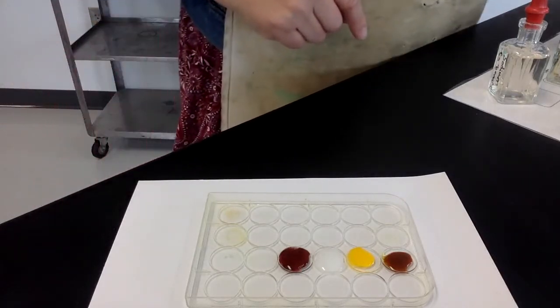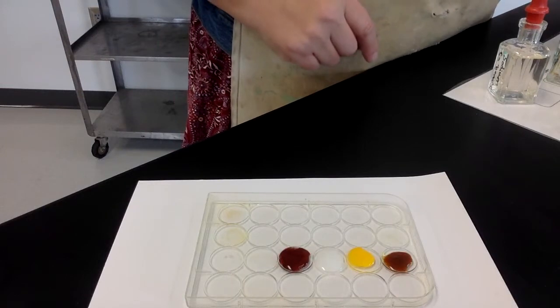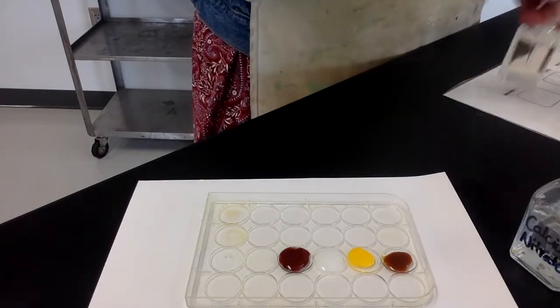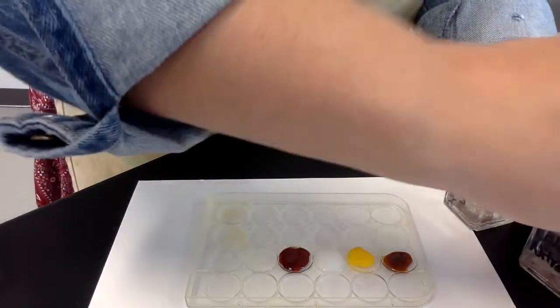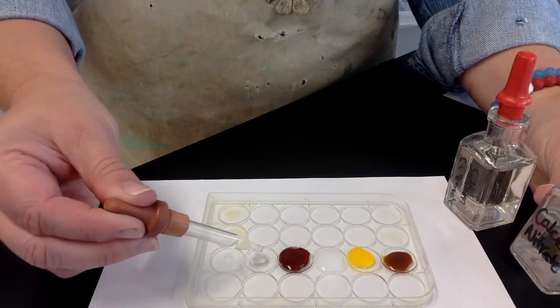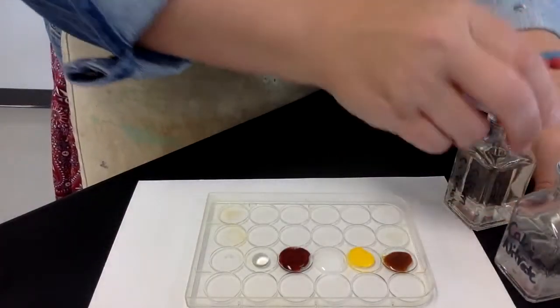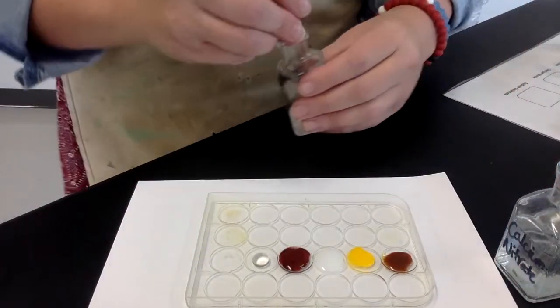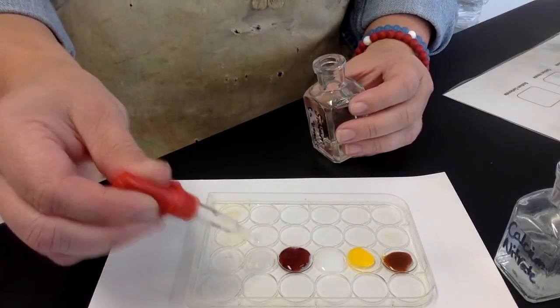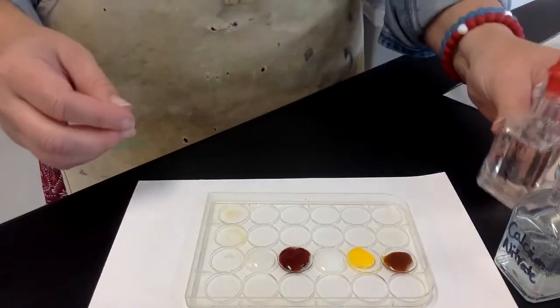All right, we are on number 5. Is this our last one? Yeah, it is. Okay, so we've got calcium nitrate this time and sodium carbonate. All right, so calcium nitrate, clearish. So 3 little drops there. So there's our first solution, calcium nitrate. And then we've got a little bit of sodium carbonate.